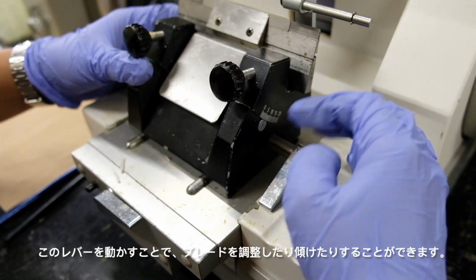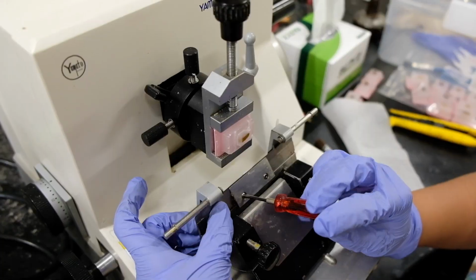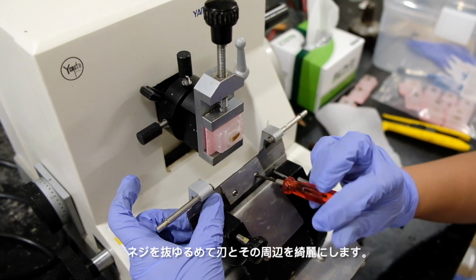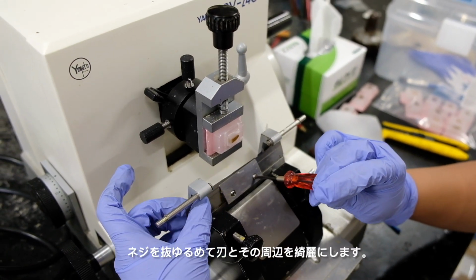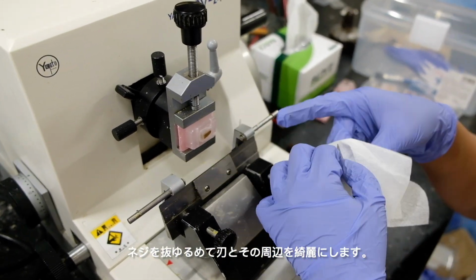By moving this lever, we can also adjust and tilt the blade. We can also unscrew this part of the microtome, and that allows us to take out the blade to clean it and also clean the surrounding areas.